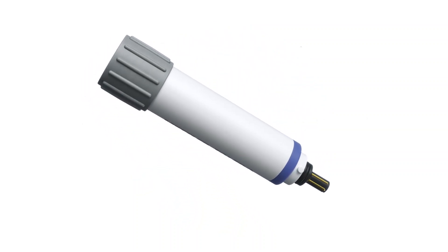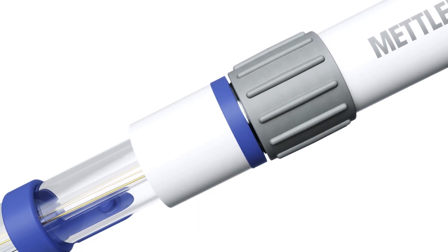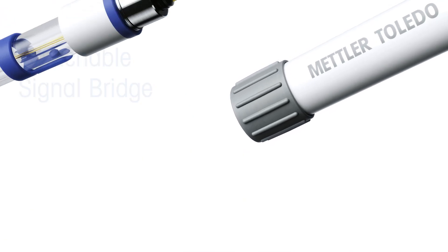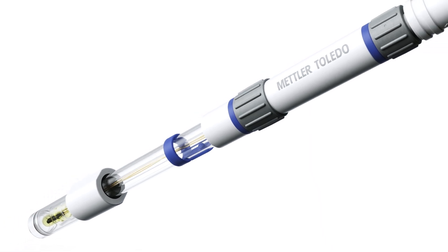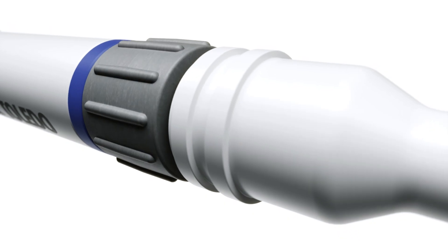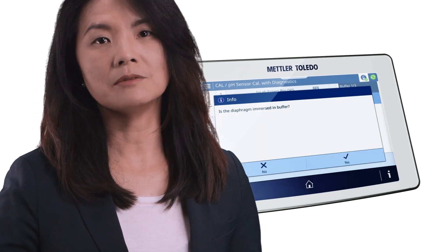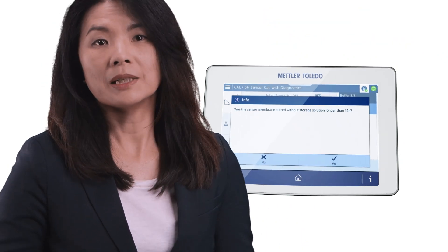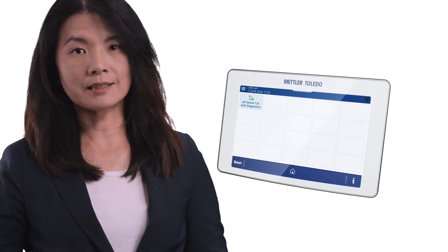Flexibility is key in any lab, so we designed the new diagnosable digital sensor to be fully modular. Since the detachable signal bridge holds the measurement electronics, just replace the sensor at the end of its life and reuse the signal bridge — which works for different sensor modules with the same parameter. You can even swap cable lengths to fit your workplace setup, and you really only need one cable for all your digital sensors. For peace of mind and to help prevent downtime, we developed a diagnostic program with user guidance that keeps you informed about sensor condition, making troubleshooting easy, detecting potential issues early, boosting your productivity and extending the sensor's life.